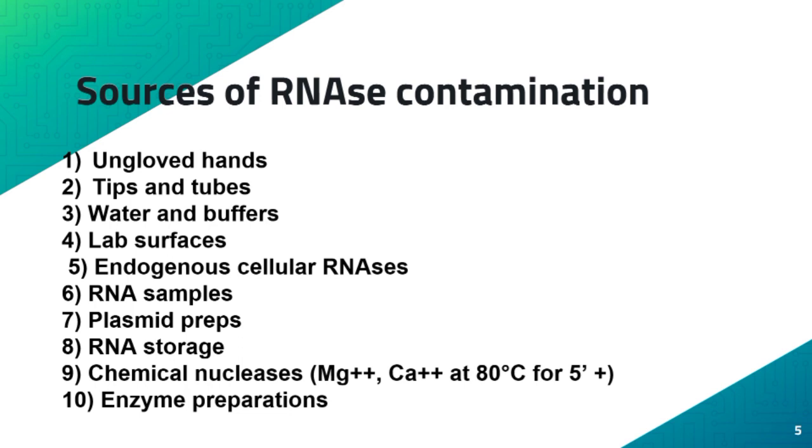When it comes to contaminated solutions and buffers, we can use good sterile technique, treat solutions with DEPC, and make small batches of solution to avoid contamination. When it comes to contaminated equipment, use pipettes, glassware and gelware under sterile conditions and bake glassware at 300 degrees Celsius for 4 hours. Use RNase-free pipette tips and treat equipment with DEPC.